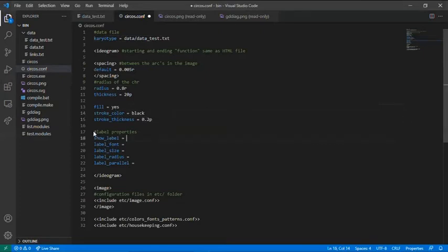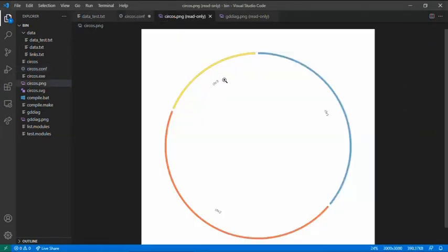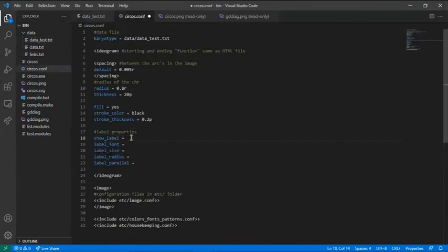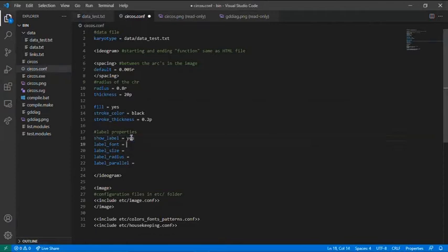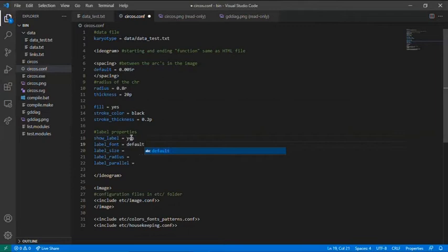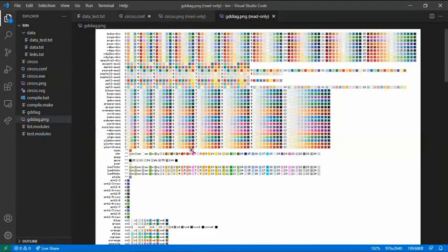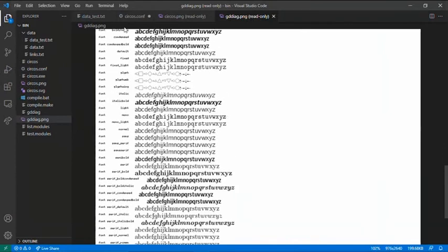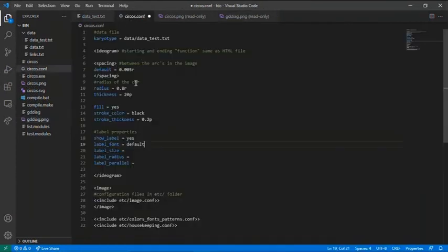If you want to show the label, here I have the labels. What it means, these names are the name of the variables. Write show label and press yes. Label font, I will put it as default. But you can choose again. You have all the fonts you can use on Circos. The label size, I will put 34.